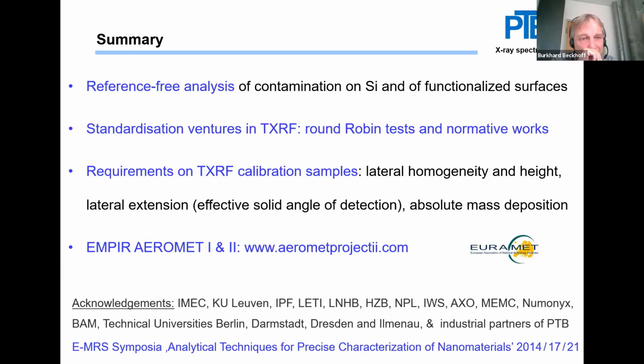Summary. So I've shown you some work on the reference-free analysis of contamination on silicon. I've introduced you to some of the standardization ventures in TXRF, shown you some specific aspects of recent round-robin activity, and introduced you to the requirements on TXRF calibration samples, such as lateral homogeneity and height. This was the implicated information in the recovery rate tests that we did.